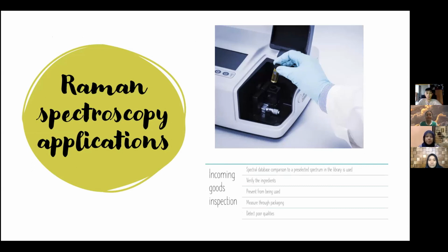Next, Raman spectroscopy application for incoming goods inspection: spectral database comparison to a pre-selected spectrum in the library is used. So it can verify the ingredient.